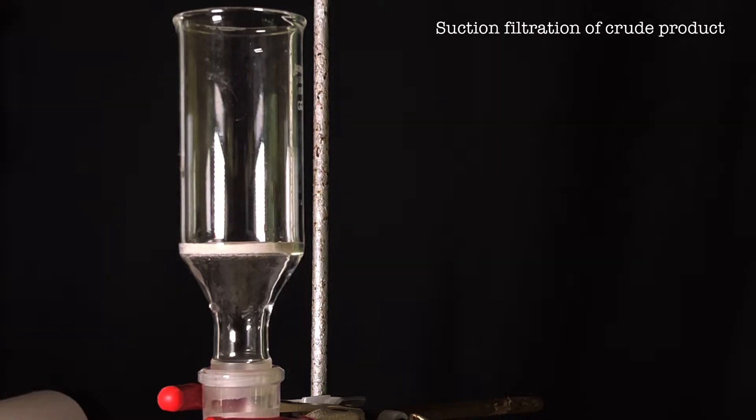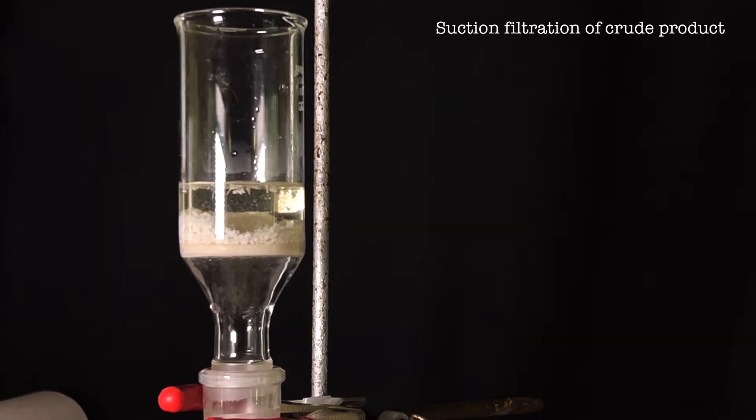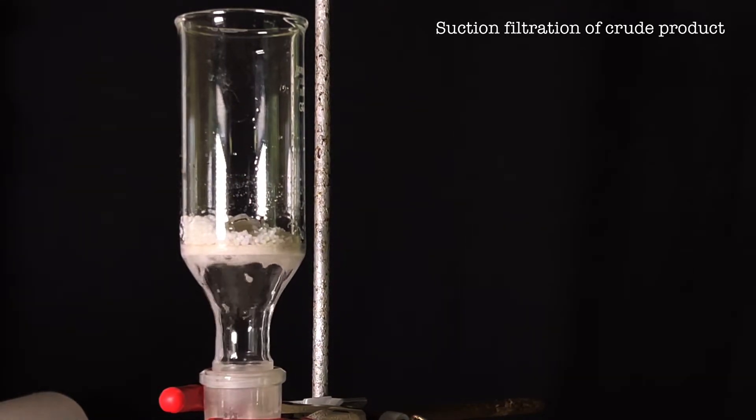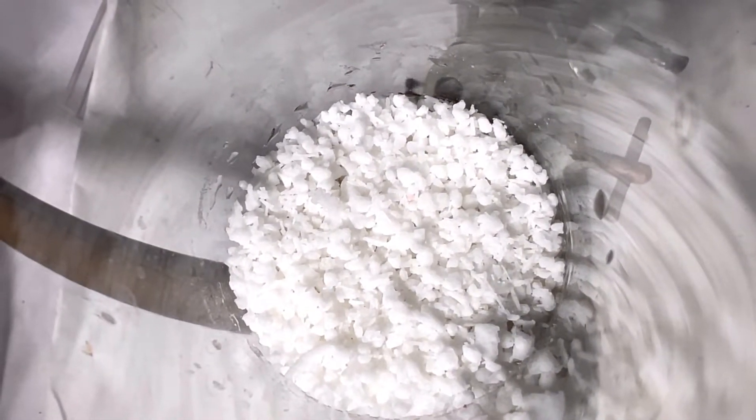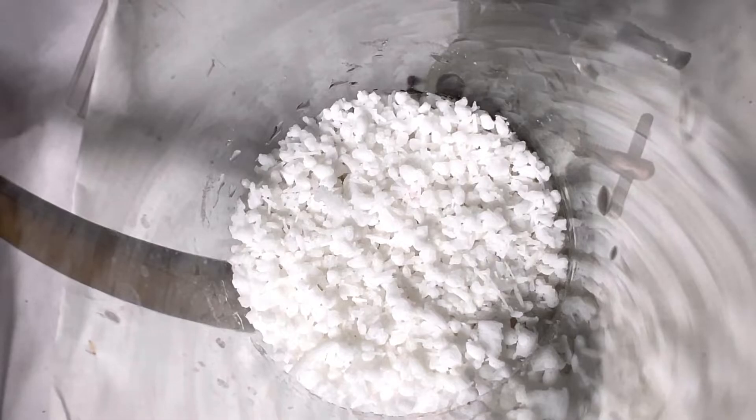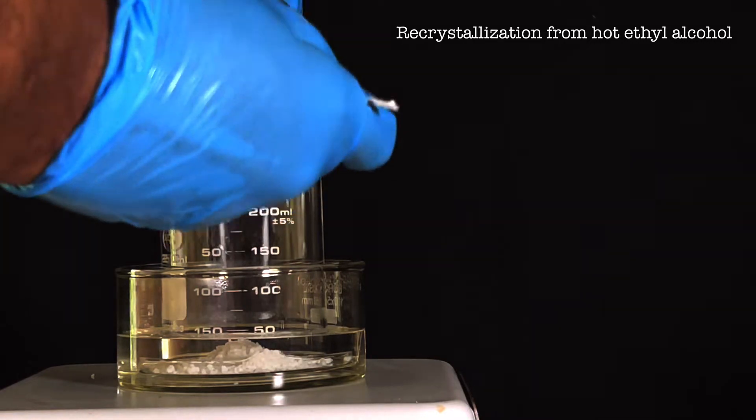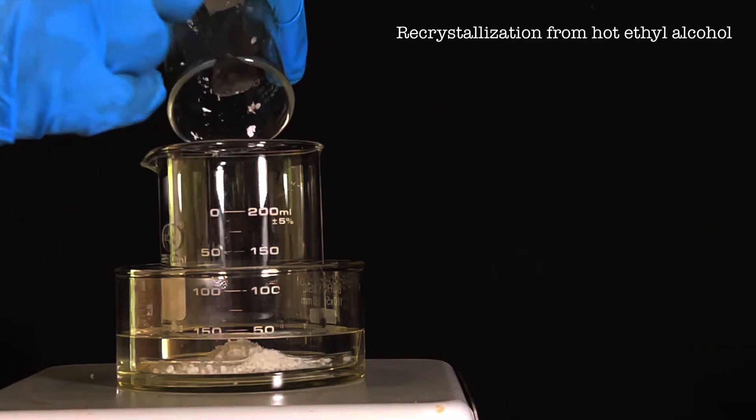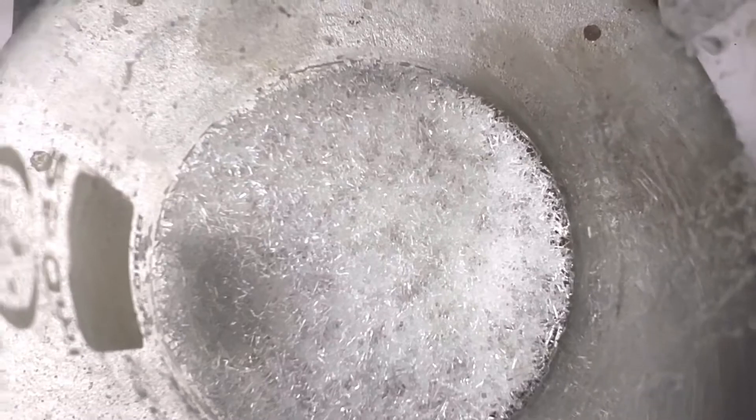After 20 minutes, the product formed was vacuum filtered. This is the crude product after letting it dry by using the vacuum pump. Next, the compound was recrystallized from hot 96% ethanol solution. On cooling down, needle-shaped crystals of phenyl benzoate were formed.